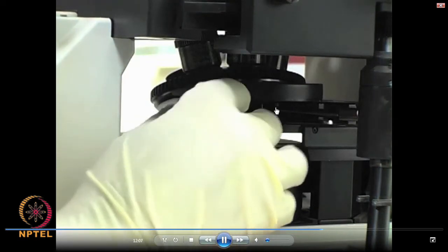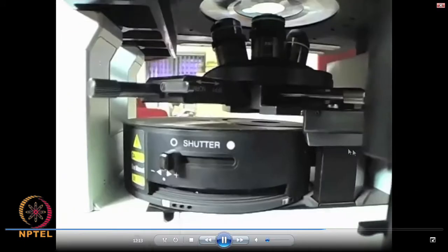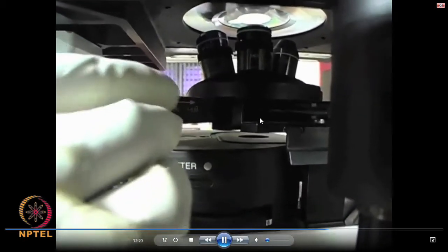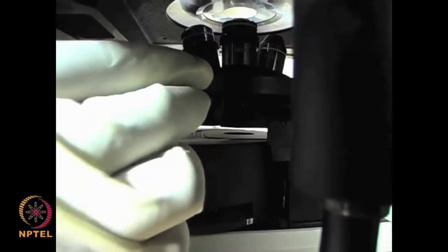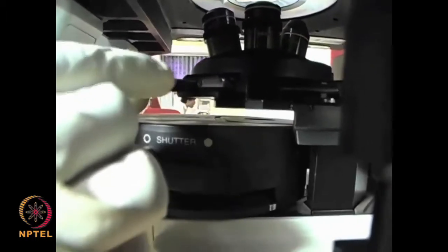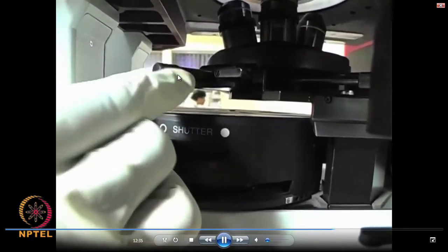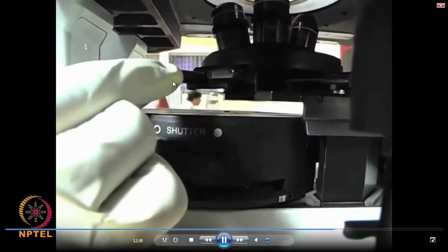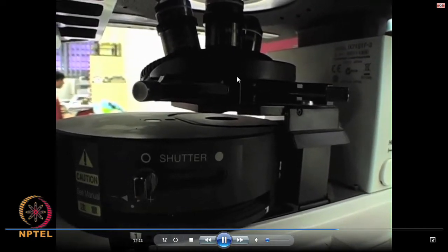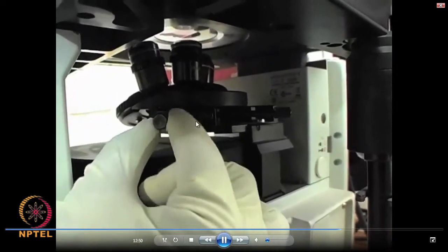What you are seeing now is a part called the analyzer. The operator is just inserting the analyzer. This analyzer is used when we operate the microscope in differential interference contrast mode, DIC mode, and you can set a preference for constructive or destructive interference using this knob. Turning this knob, you can make the preference of constructive and destructive interference. We will see at the appropriate time how it is useful to use these parts.